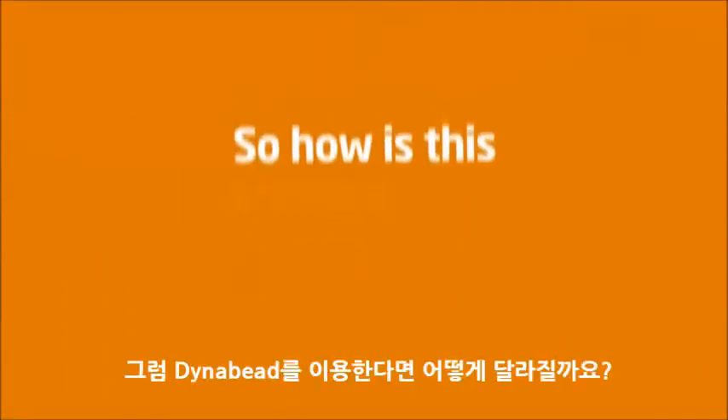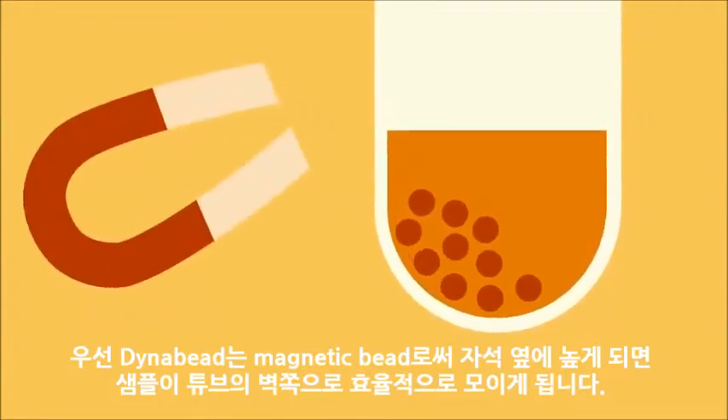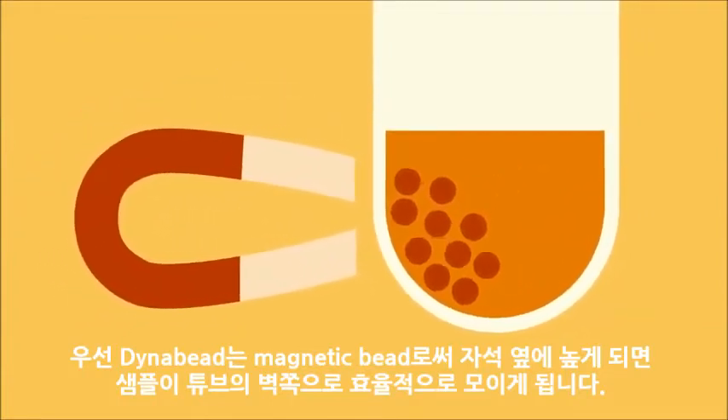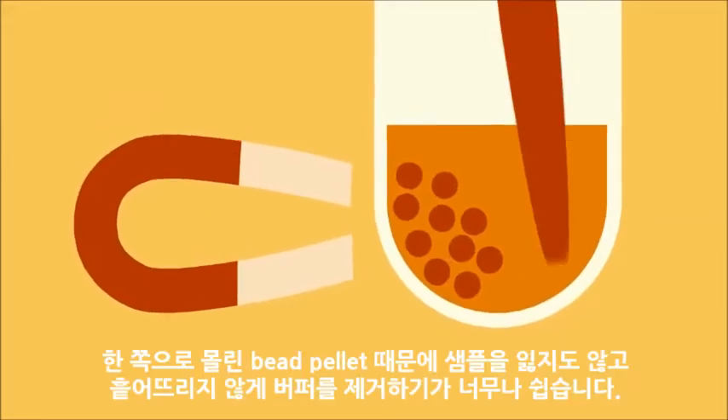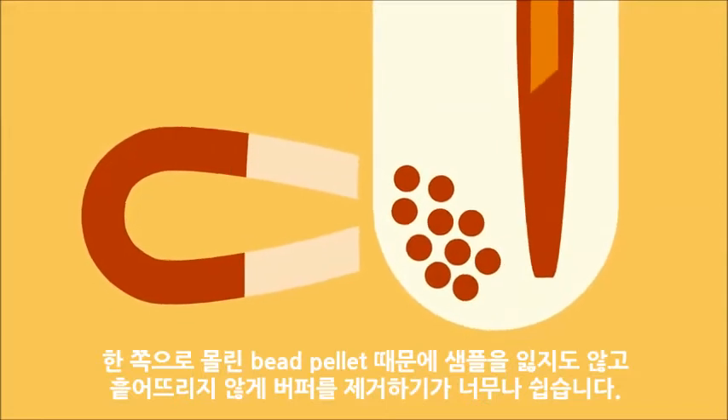So how is this different when you use Dynabeads? Firstly, Dynabeads are magnetic beads that are efficiently pulled to the side of your sample tube when a magnet is applied. With the bead pellet now on the side, removing all the buffer without disturbing or losing your sample is a lot easier.